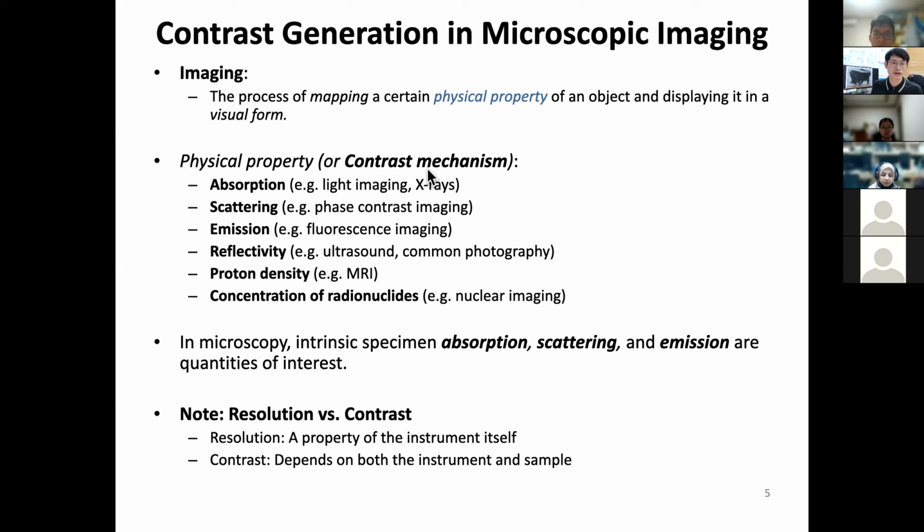So what would be those? I have some illustrations of things here. Let's think of what we know a lot about imaging. For example, light imaging, the same one as I just said, the overhead projector. And X-ray imaging. You all remember that X-ray imaging is absorption of X-rays to give a contrast onto your screen. So that's a good example.